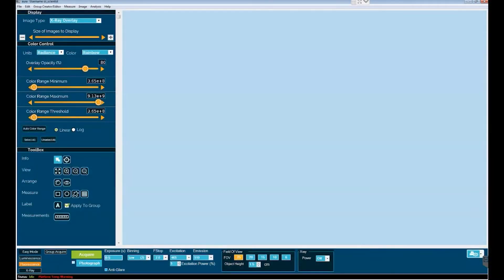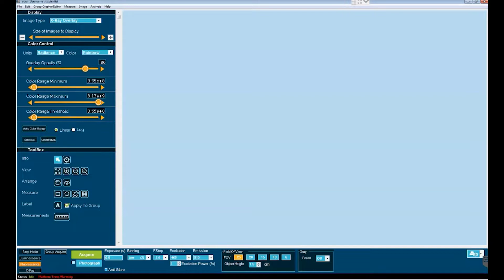In this tutorial, we will be highlighting the Group Acquire feature in Aura. Group Acquire is a feature that allows the investigator to set up a protocol that will take multiple images sequentially over time.